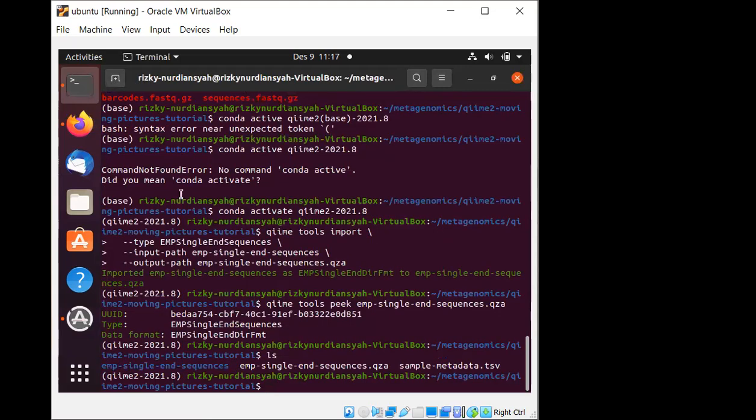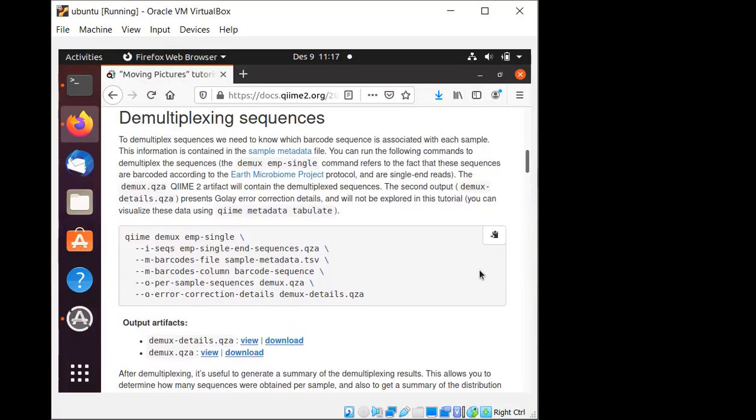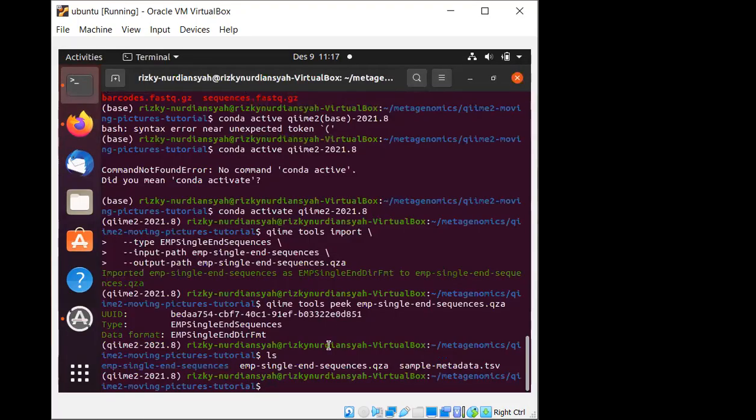So yeah, it is still on this one. Maybe let's just try to run it from the outside. Let's see what happens.